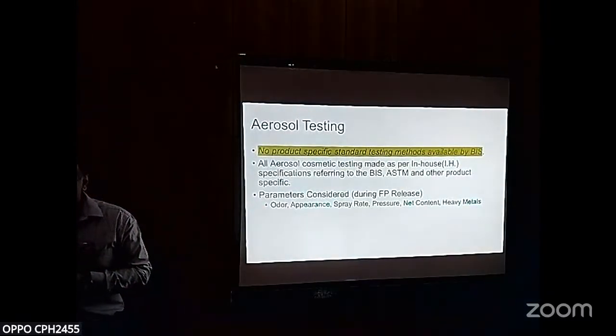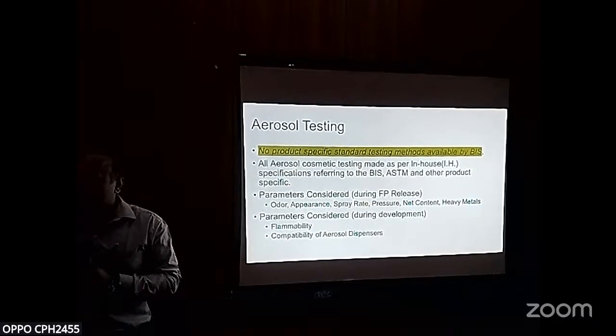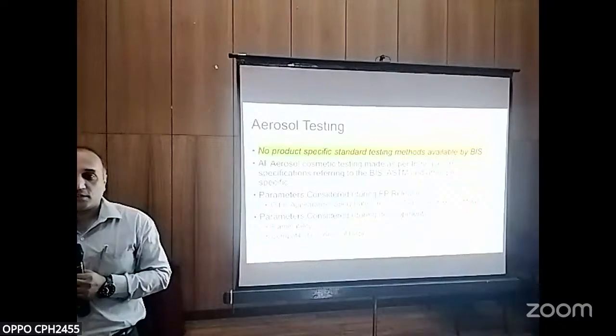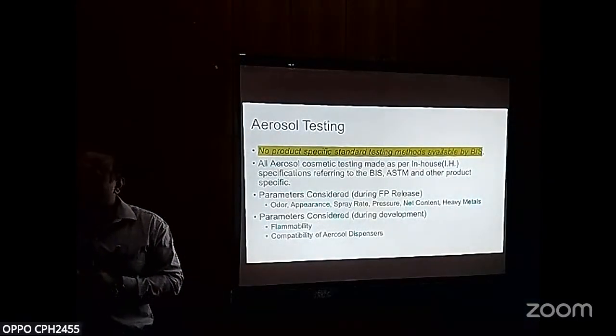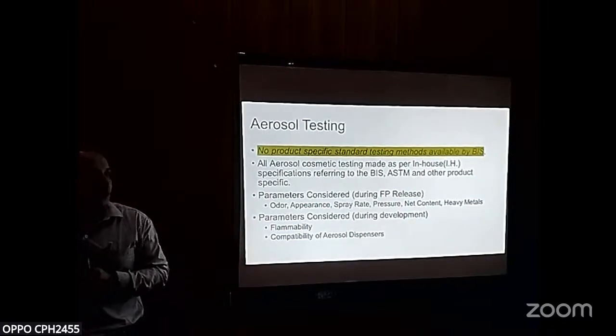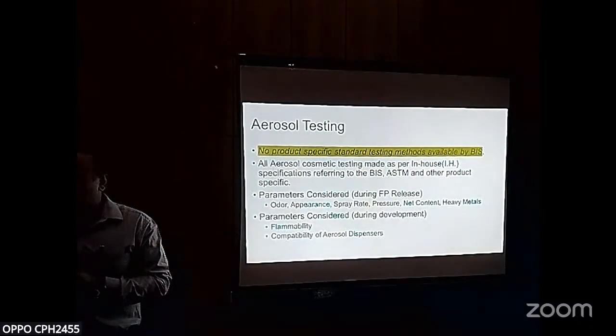The major parameters we consider are odor, appearance, spray rate and so on. The testing protocols given by the BIS are flammability and compatibility of the aerosol dispensers.